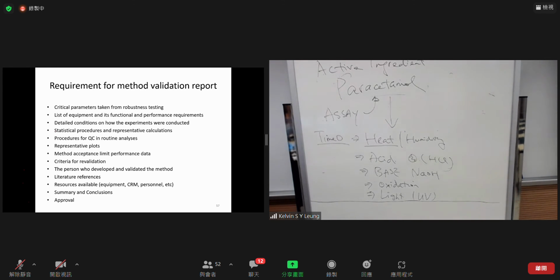Let's say, as I've mentioned, the solution stability studies. Maybe you have done the studies, but what can you draw from them? What can you conclude? Let's say maybe it's very stable. The standard can be put at room temperature for, let's say, a week, according to the data that you have in your study. Sometimes you do two time slots, maybe a week and two weeks.